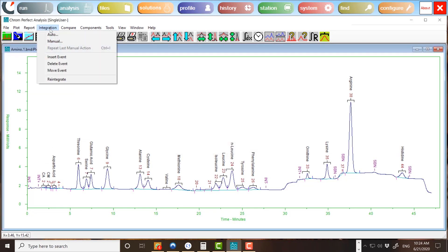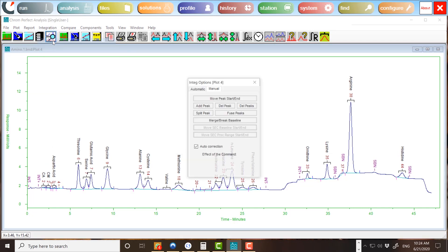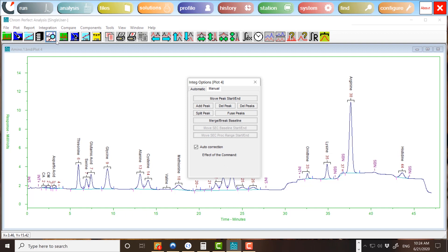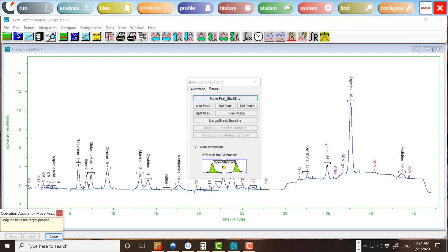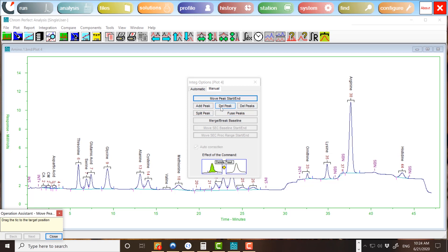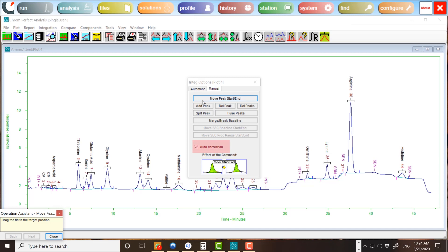To manually integrate a chromatogram, choose Integration, Manual. The following form will appear. Click on any button to see the typical effect of the action. If the Move Peak Start or End, Add Peak, or Merge or Break Baseline actions are selected, then the Auto Correction checkbox will be active. If this box is checked, then the new baseline will be snapped to the chromatogram. If this box is unchecked, the new baseline will be located exactly where the user put it.